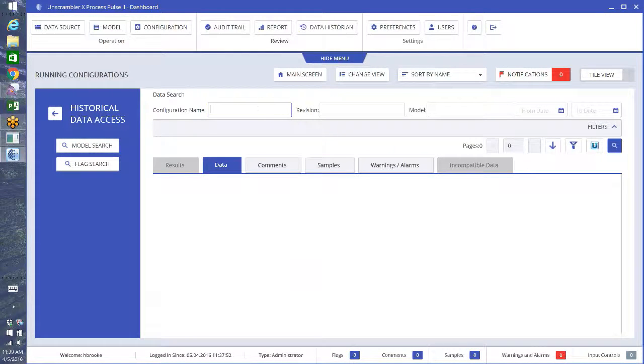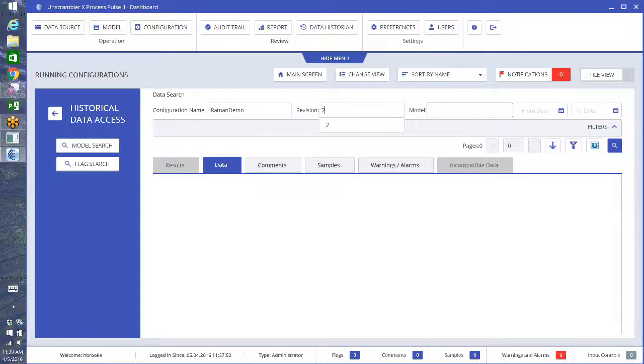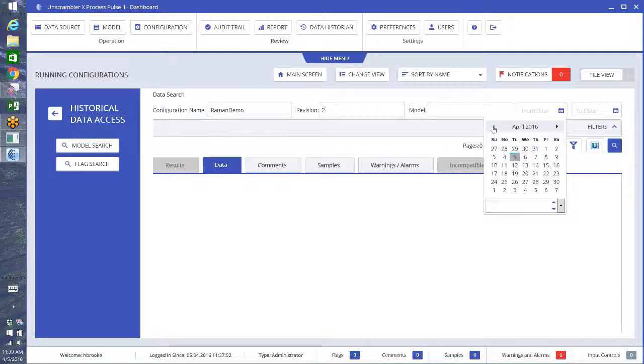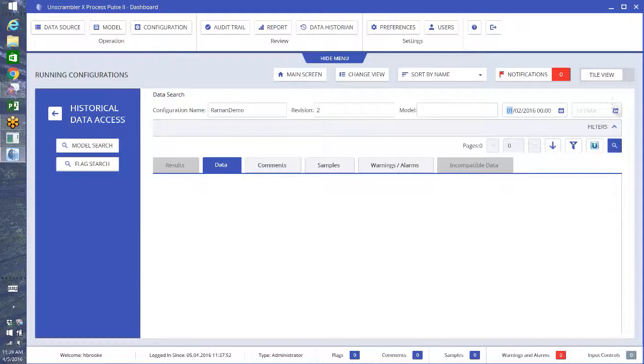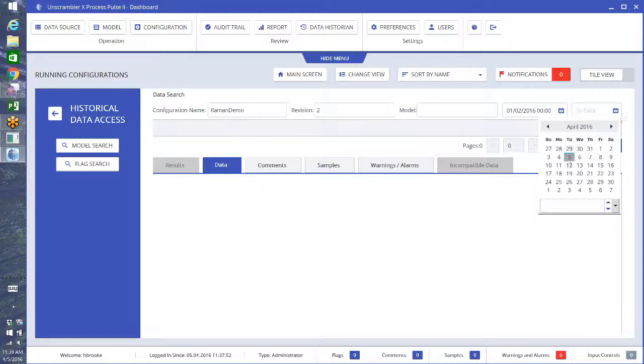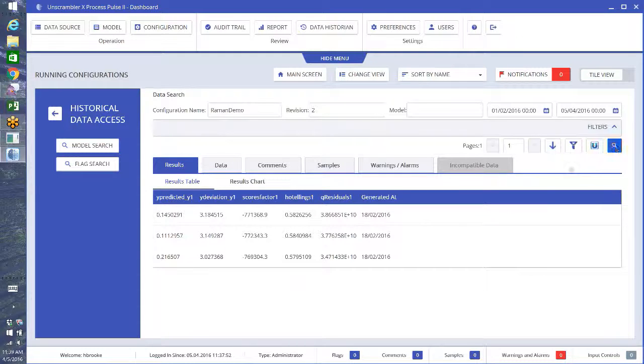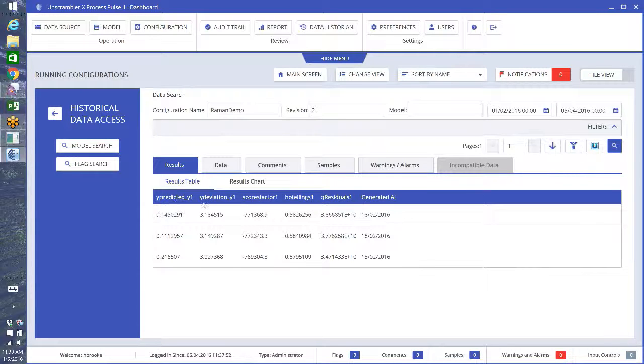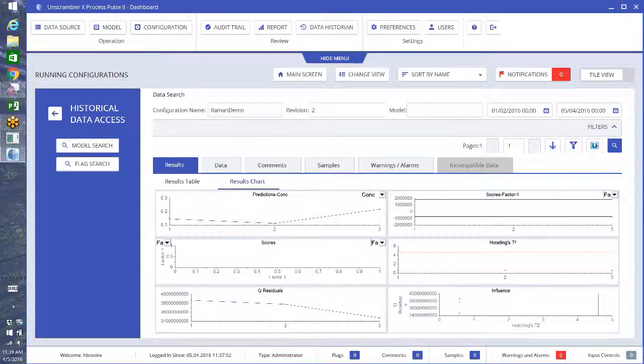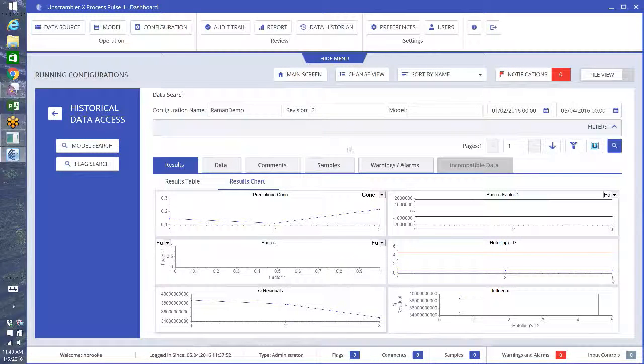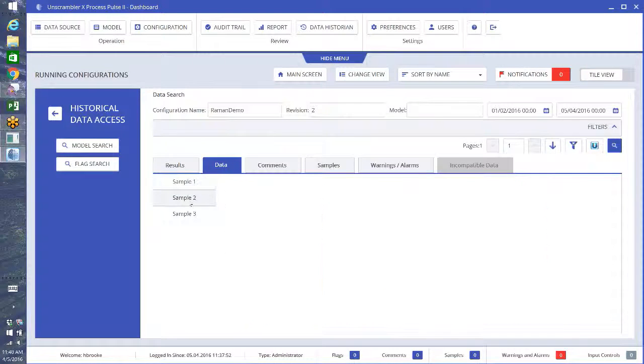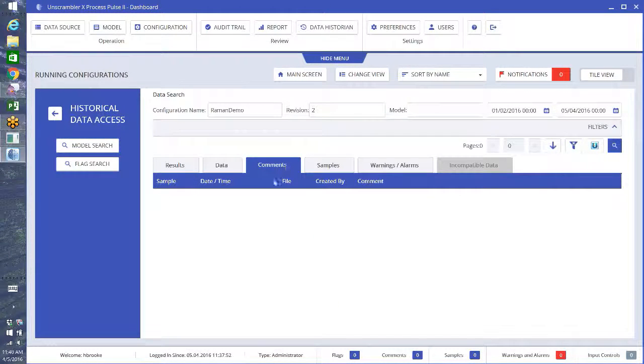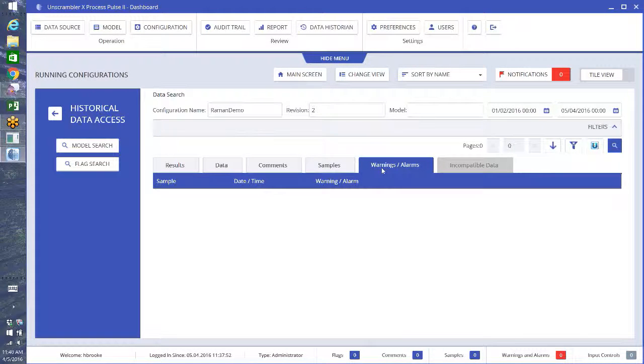We find a configuration name, Raman Demo, I believe we have version 2, and let's go back. I'm going to go pretty far just to make sure that I have some data in here. Search, and you see here are things that I collected during this time. We can see the actual results, whatever we told it to display, so our predicted, our deviations, scores, Hotelling T-squared, residuals, and when they were generated. We can also look at our results charts, so that's going to give me some graphs. Data is going to show me my raw spectra. If I put any comments in there, they would show up, sample information. If there were any warnings or alarms, they would show up here as well. And that's the brief overview for Process Pulse 2.